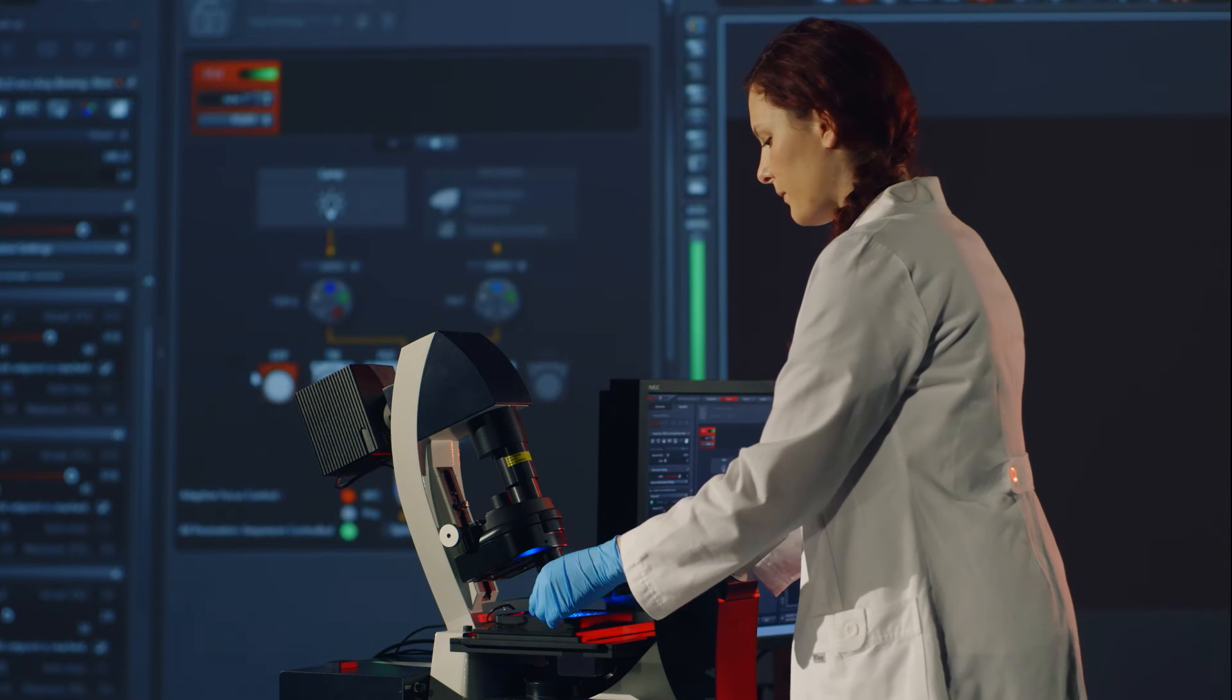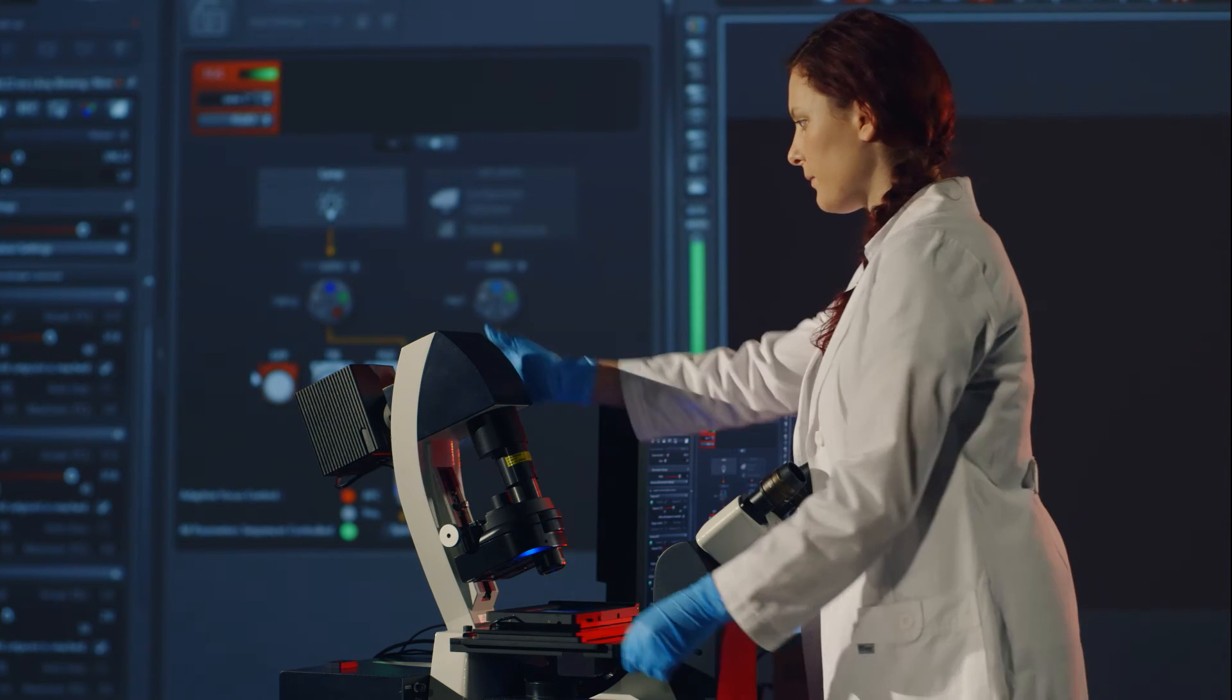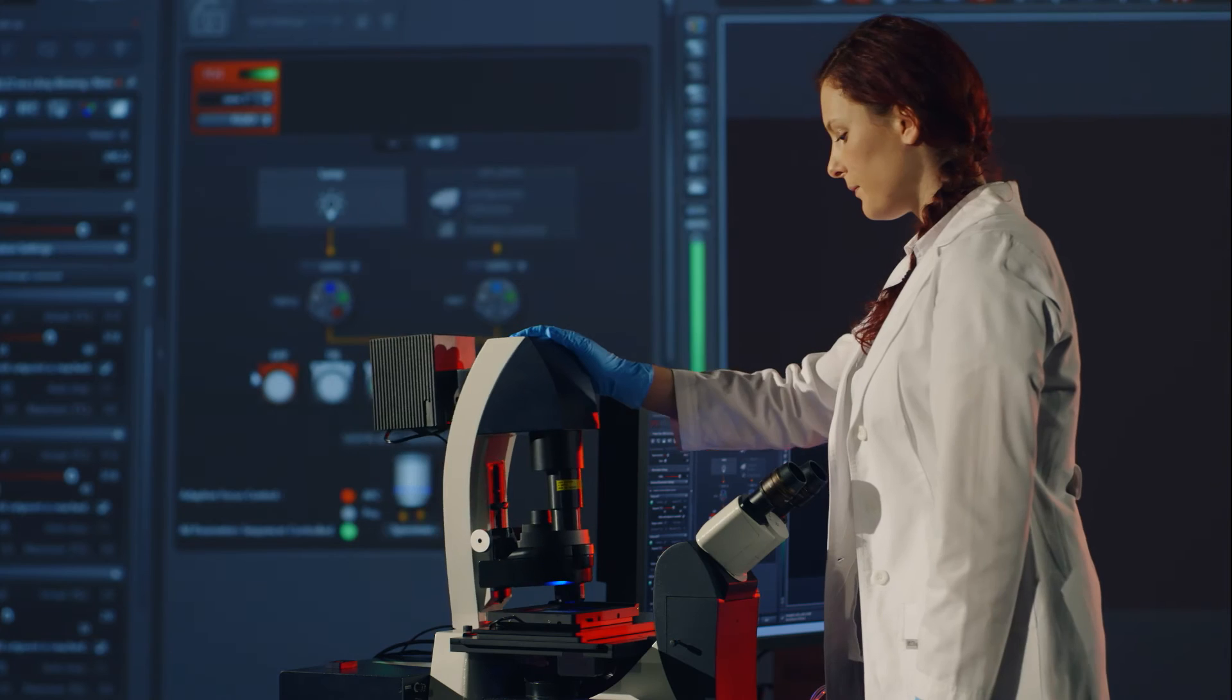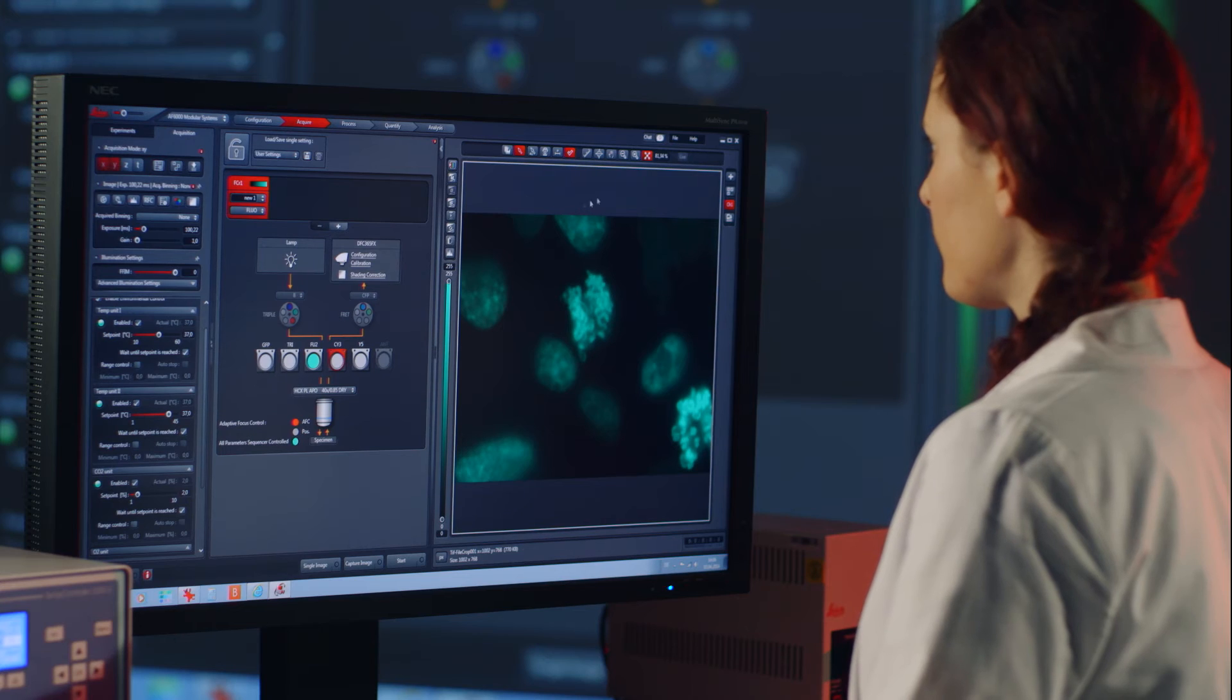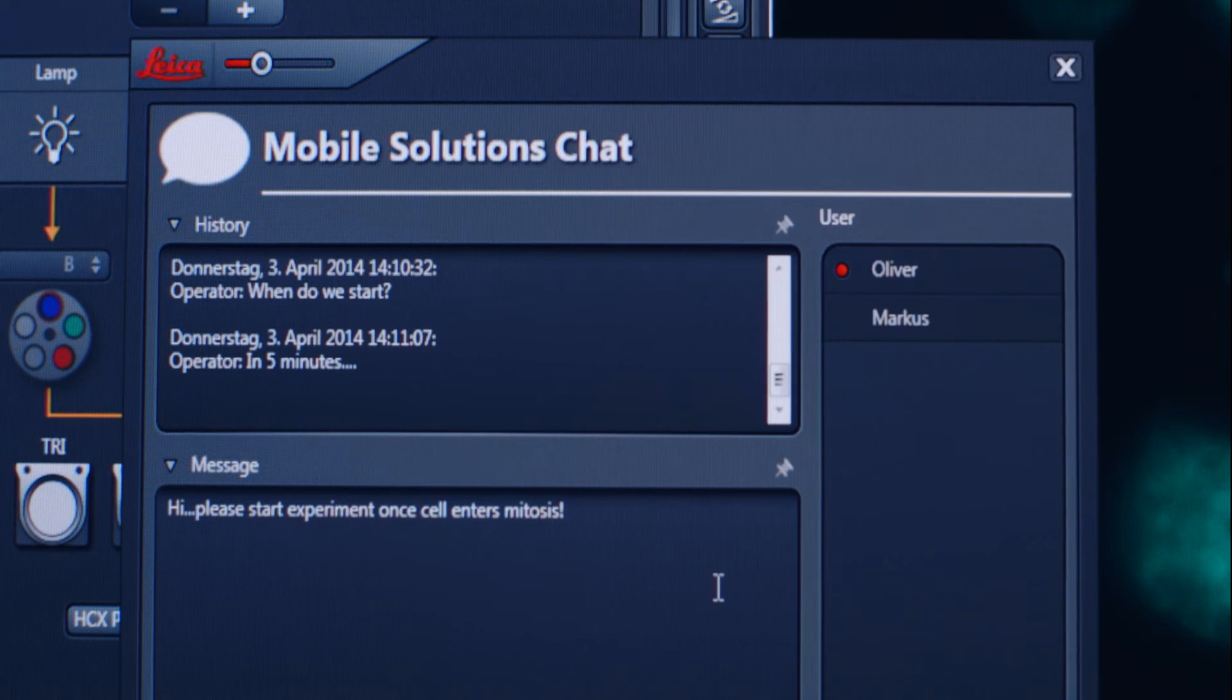With the Mobile Connection module, you can stay connected to your experiment anywhere, at any time. Don't miss anything.